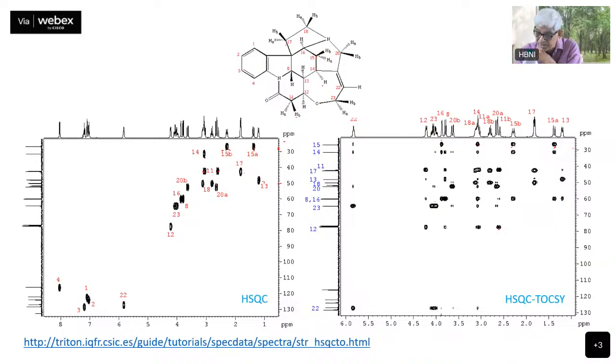You can look at this one here, which is this one, 20A. This one is 20A probably. So 20 and this is 12 here. And where is 12? 12 is here. Okay, now let's look at 12. 12 is showing relay to this one, and this one. And which is this one here? This is 16. 12 is connected close to 16. Where is 16? 16 is here. No, it may not be 16 then. There must be some other one which is there, or this is a weak one there.